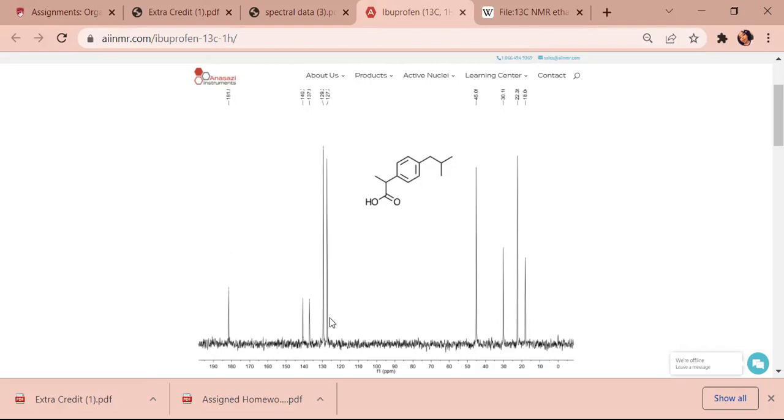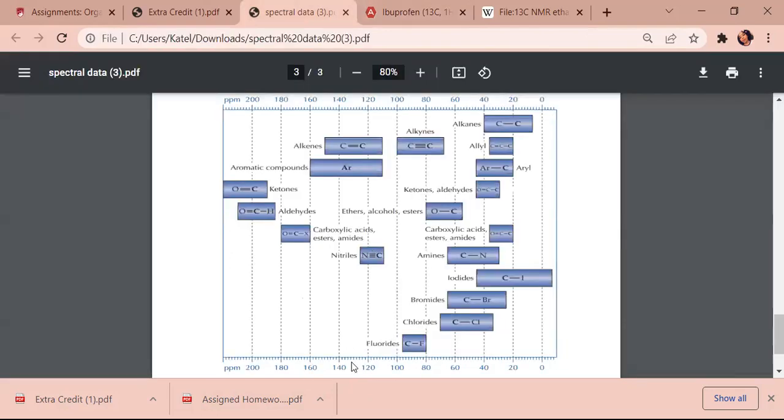So if we want to look at the structure for aromaticity, we will look towards the middle, that benzene. That's really signifying these guys right here. So if we look on the NMR spectrum, because this is about 120, it's probably a little more than 125, but we'll say about 125, and then this one's almost exactly 140. So if we were to look at that over here, it starts around 115, I would say, but it's between 120 and 160.